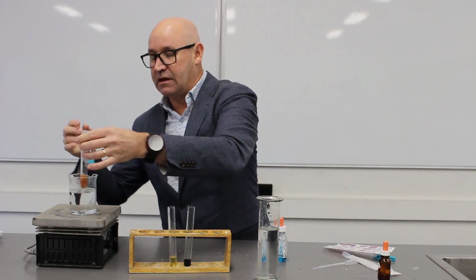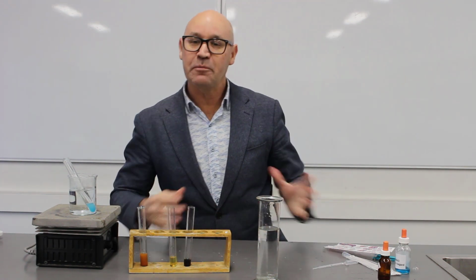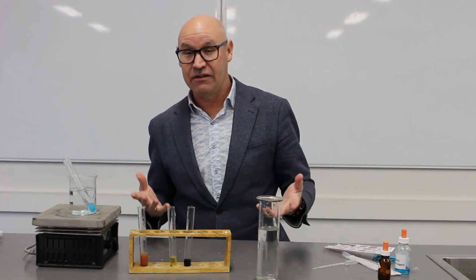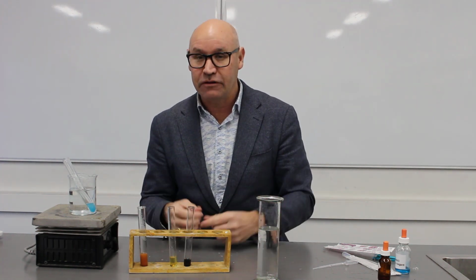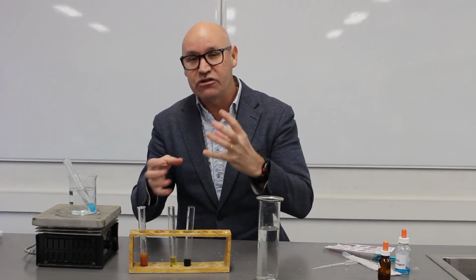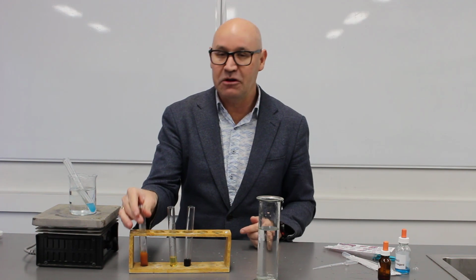Okay, now I'm going to take this one out and we'll leave that go. Look, with the Benedict's test, it's sort of semi-quantitative. We can look at how long it takes for the red brick precipitate to appear. The more glucose there is available, the quicker it appears, and also how strong the orangey red colour is. The more glucose, the stronger the orange and red colour is. So it's kind of semi-quantitative.